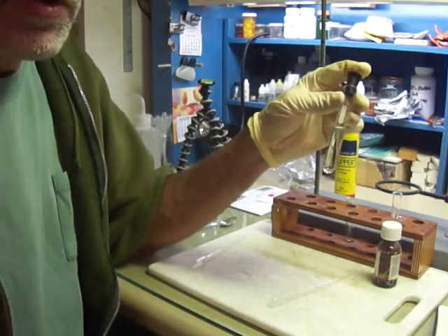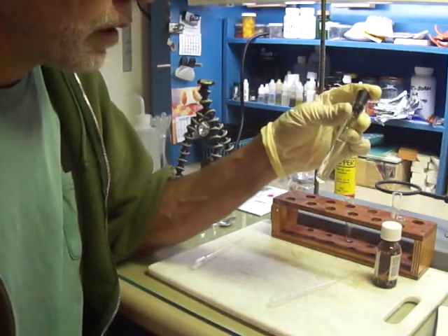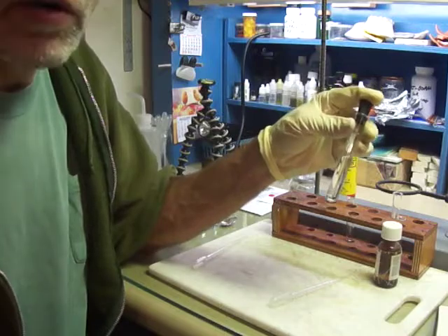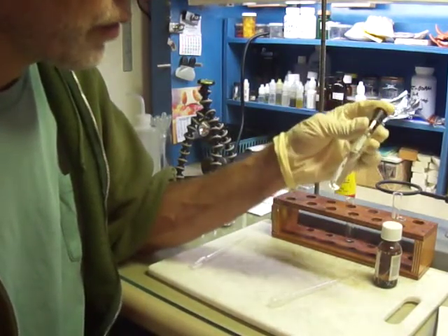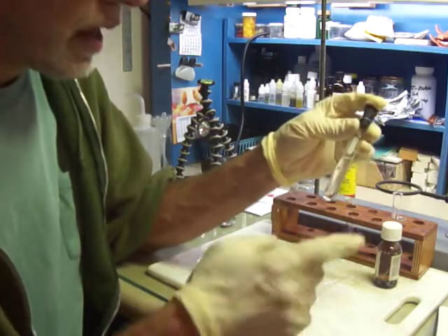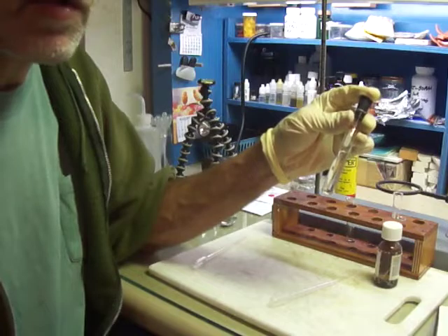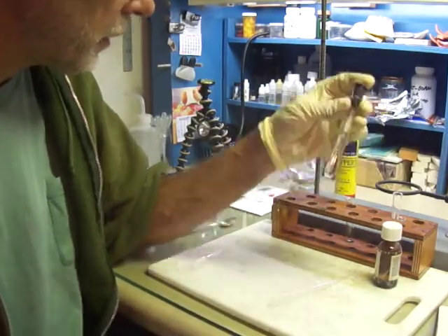The first thing we're going to do is test for the silver group. I'm going to assume that there's nothing weird as far as rare earth elements or anything like that. So we're going to go right to testing for the silver group, which means we add a chloride, and if there's a silver, lead, or mercury chloride that is insoluble, you'll see it as a precipitate.